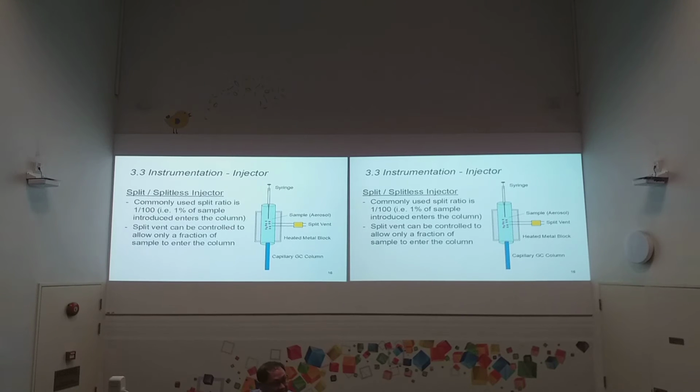And then how about the length? It could be maybe 30, 40 meters. But a capillary column, in terms of diameter, is 100 times smaller than this. I will show you an actual one later. In terms of total length, 30 meters is the norm.